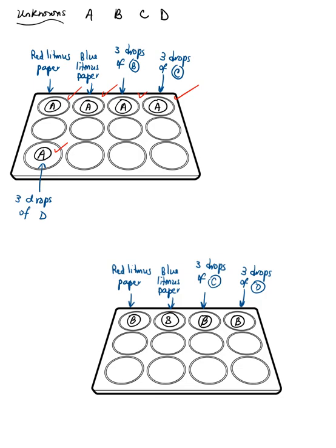So to find out what you have, you're looking at your 7 initial solutions. Okay, you have them labeled 1 through 7. So you're comparing your observations from the known solutions with these ones here to actually say, okay, I think A is silver nitrate, B is hydrochloric acid, C is sodium carbonate. So when you're done with your unknown A, transfer everything into your waste container, rinse the spot plate, and now we're going to move to your unknown B.